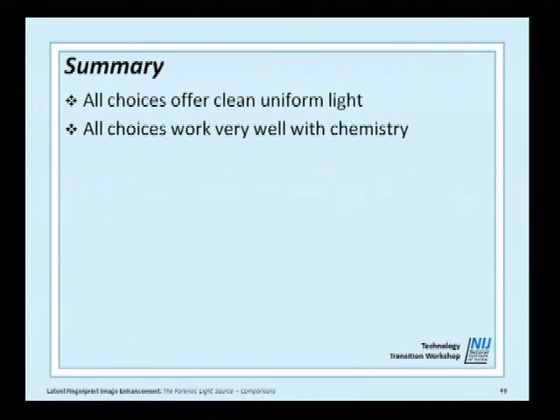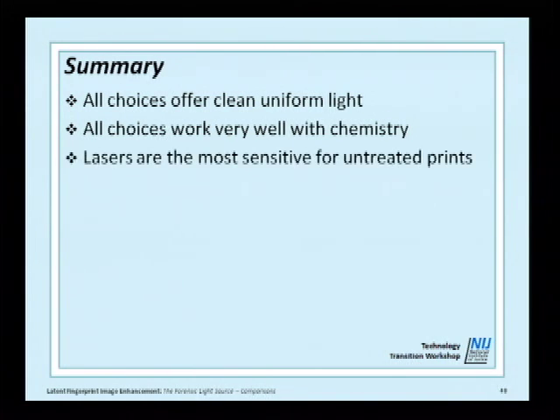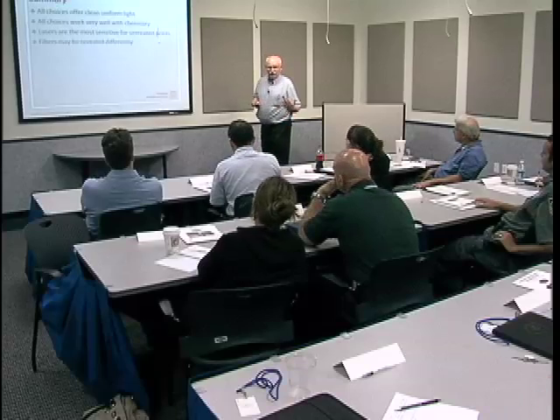As I said before, you're not going to have the laser working really well with either brilliant yellow or acid yellow if you're doing blood impression enhancement, because you have more choices. It's like having a box of crayons with 30 colors as opposed to one really nice color. Lasers are the most sensitive, in my experience, for untreated prints. Fibers can be revealed differently by the different light sources, which, in my opinion, is why it's a great idea to have that range of excitation choices, particularly for crime scene stuff.